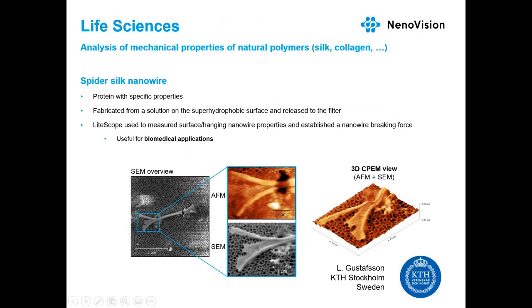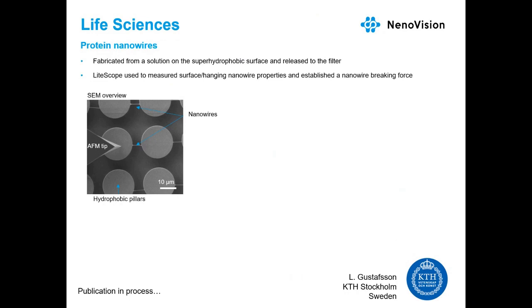Again, using the SEM and AFM simultaneously, we are bringing this very precise 3D representation of the nanowire. But then we can also start real mechanical analysis.